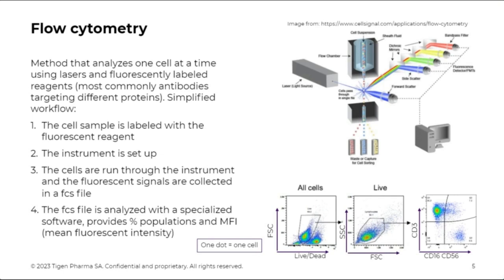So if we look at the dot plots down here, the histograms, the first one here contains all the cells, and we select what parameters we want to look at, and we put the gate around the cell population that we want to look at further. We take that population and look at it in the next window.